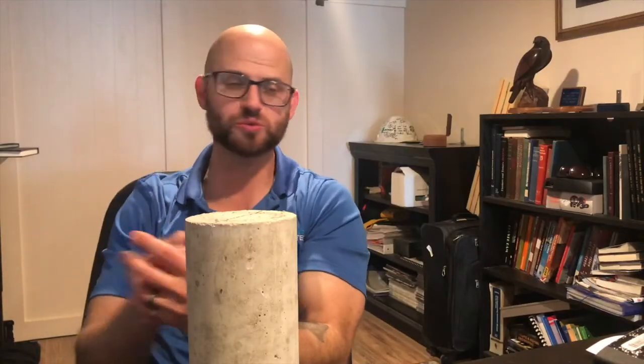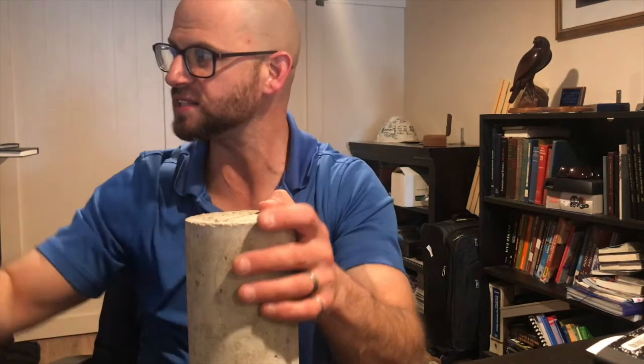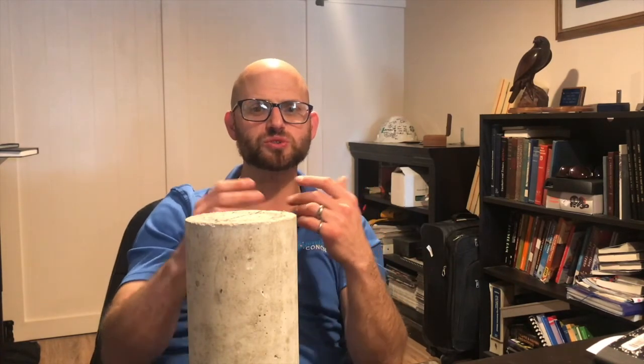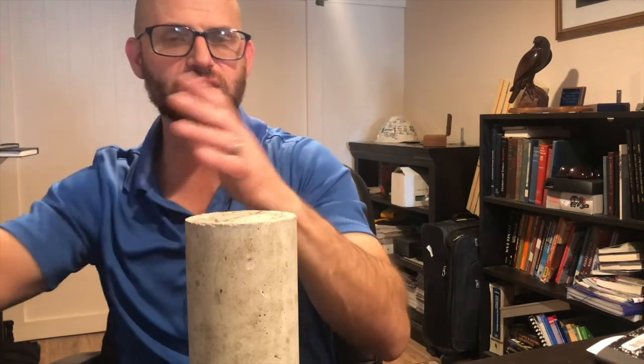So it looks like you had a piece of sand or rock or some type of aggregate just being dragged over the surface, and not only do you have gouges in the cement paste, but you actually have these cracks that go from one of these gouges to the next one. And in a superior concrete mix design, instead of having this torn out surface, you would have a denser surface or a polished surface, something that almost looked like a work hardened surface. So again, the point of this was to help you connect the scanning electron microscopy, and again, the toughest part about scanning electron microscopy is, does it connect to the real world?